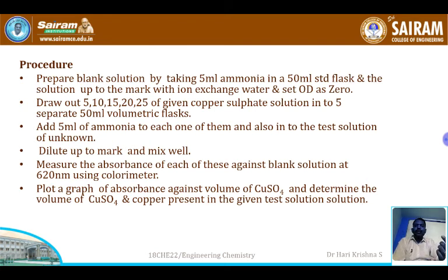So now we're going to take the cuvette. After diluting up to the mark, we're going to take the cuvette and clean it. We're going to take the blank solution. The blank solution is nothing but water and ammonia. It does not contain any sample. A blank is a substance or a solution that contains all the chemical reagents except the sample. So anywhere, a blank means it contains all chemical reagents except the sample.